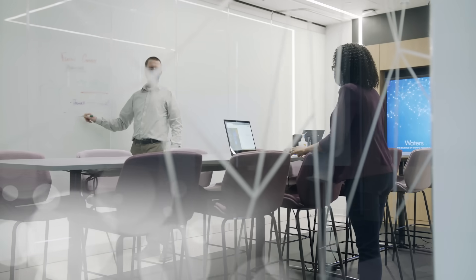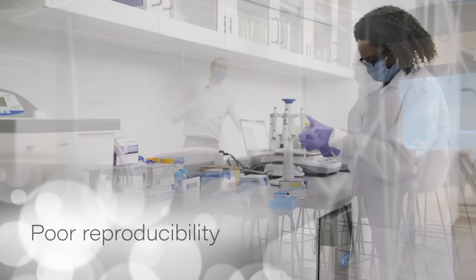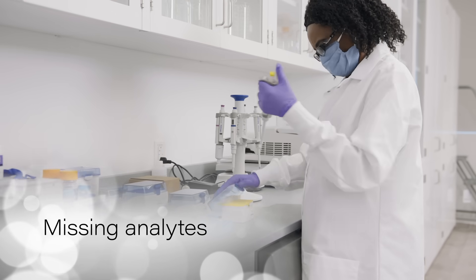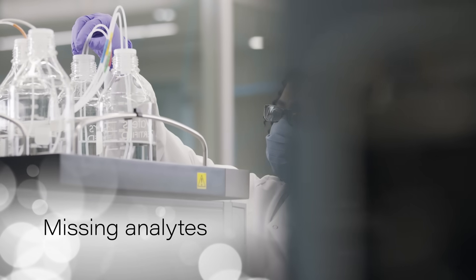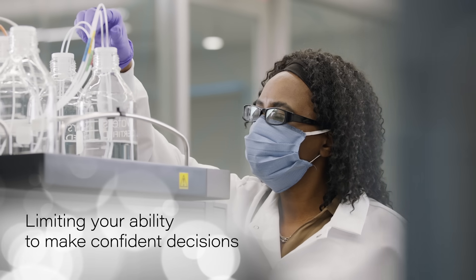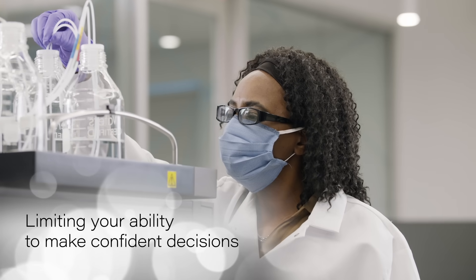Chromatographic challenges such as limited sensitivity, poor reproducibility, and missing analytes may be holding you back by opening your lab up to risk and limiting your ability to make confident decisions quickly.